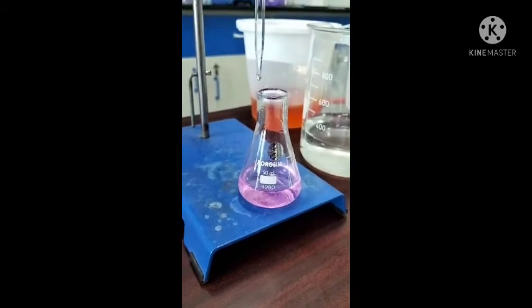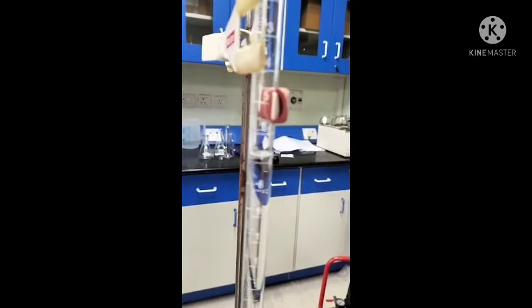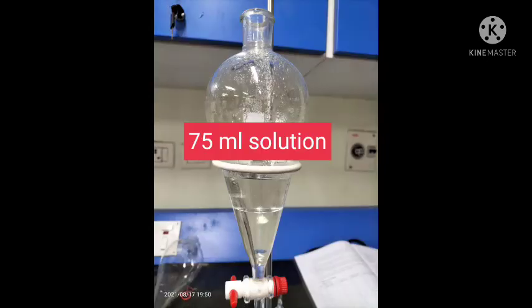You will see the solution turns pink in color, indicating the endpoint. Note down the volume and repeat the same process for the other solvent volumes: 50 ml, 75 ml, and 100 ml.